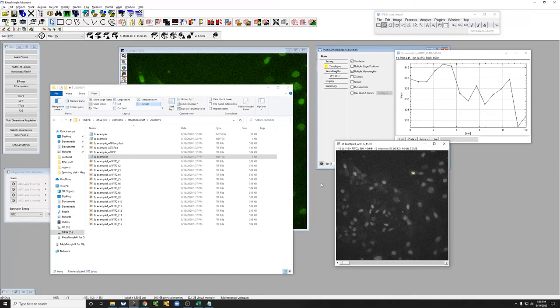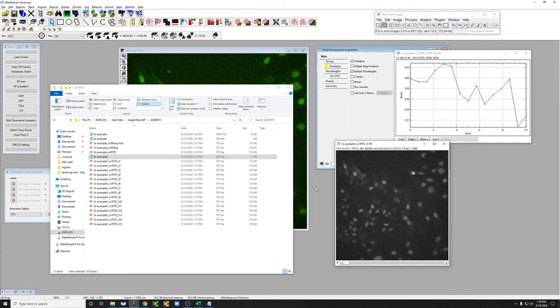The hardware autofocus on the spinning disk is a very useful tool that will let you keep your cells in focus over the course of a long time lapse.